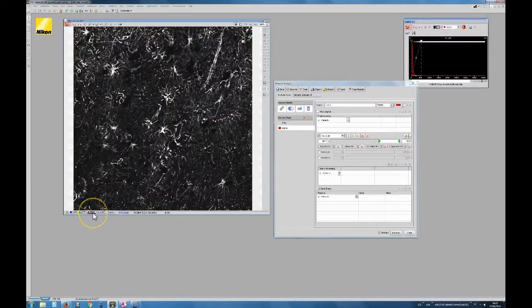So if I go here to the TRITC channel, what I'm going to try and do is create a mask on this image, a binary mask, which means an image where for each pixel I give a value of either 0 or 1. So I'm going to associate 1 with a pixel when I say this is my signal, and then 0 when I say this is not my signal. So the idea of the segmentation area is to create this binary mask and decide what is the signal we're interested in, and what is not.